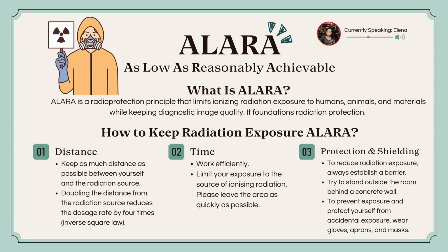And the last factor is protection and shielding. To reduce radiation exposure, always establish a barrier. Try to stand outside the room behind a concrete wall. And to prevent exposure and protect yourself from accidental exposure, wear gloves, aprons, and masks.